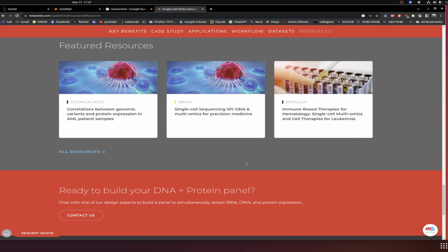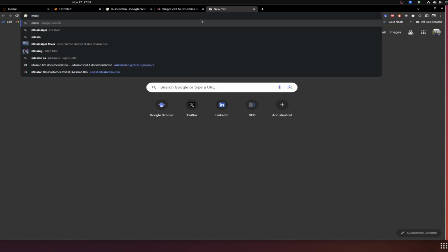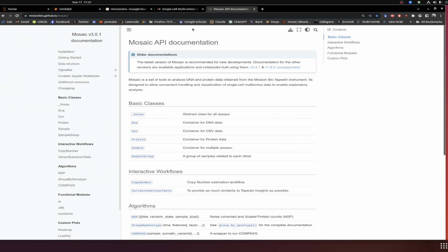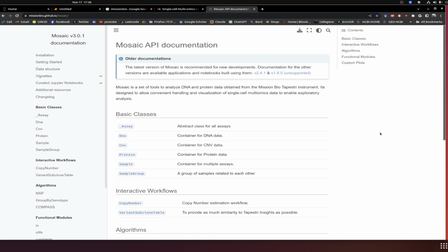So they have an algorithm that's called Mosaic. This website is regularly updated for the purpose of this analysis.